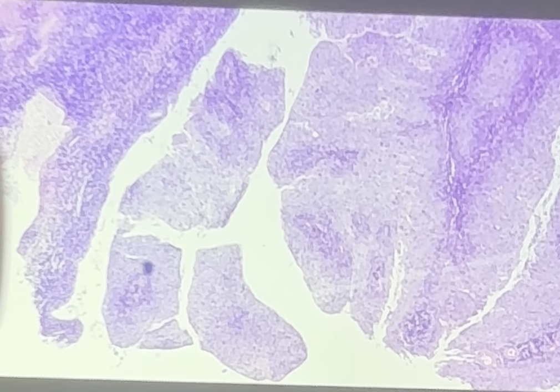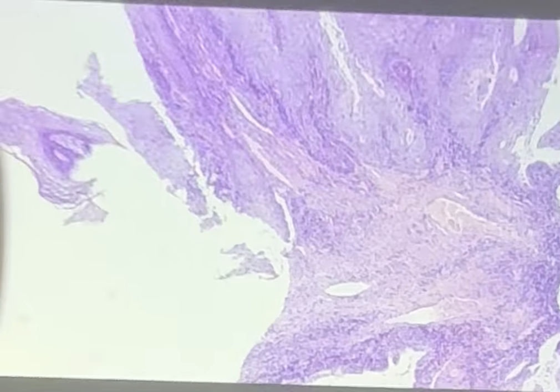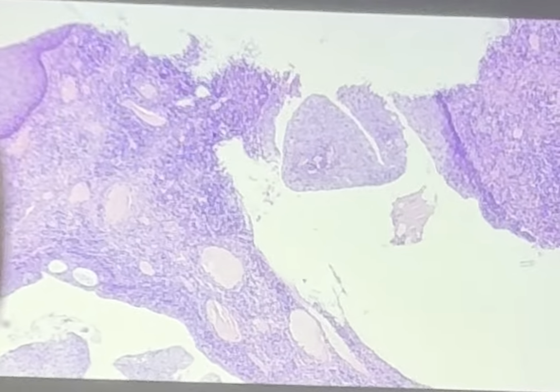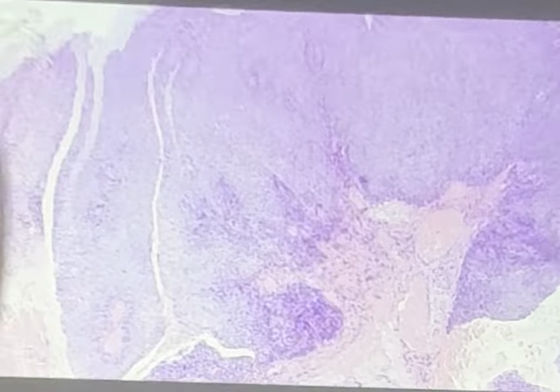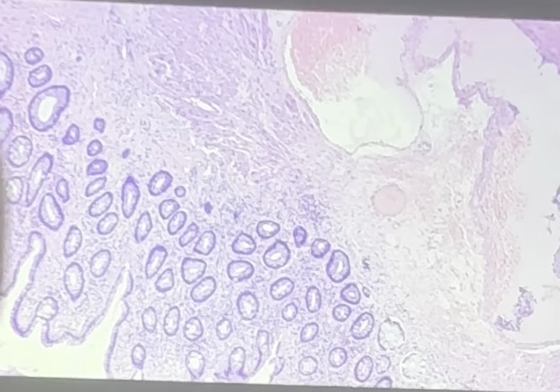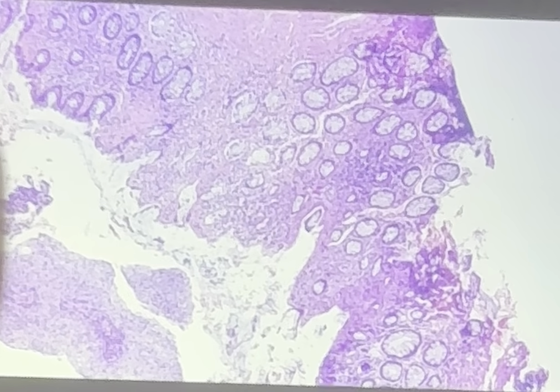Oh, this is an interesting specimen. Let's find the normal. It's somewhere in the corner, if I remember. Find the normal. Ah, yes. Here it is. It's upside down. So that means I have to rotate it and go to the other corner.